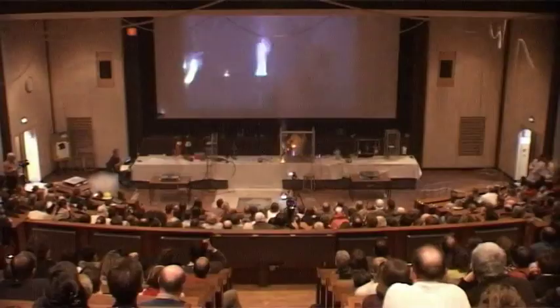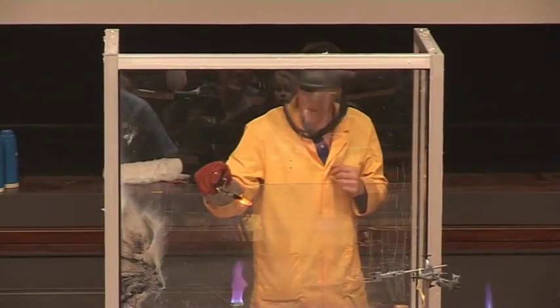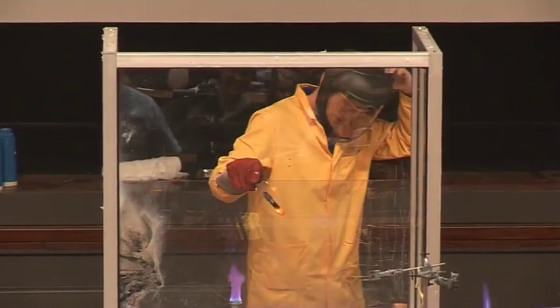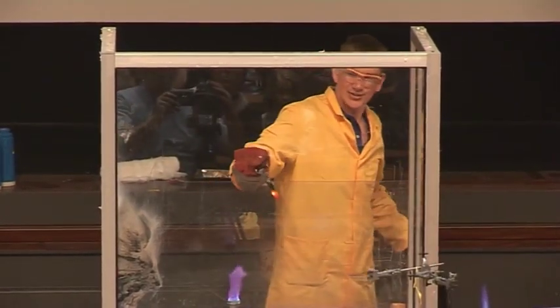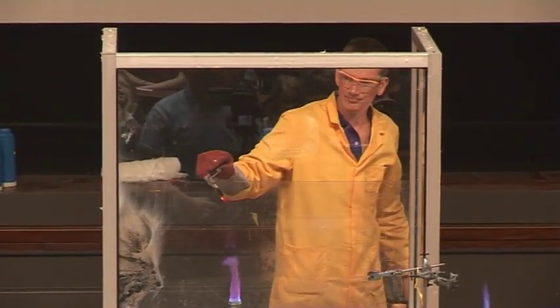Okay, there we are. It certainly did react. In fact, half of it's all over my safety screen. So even sand reacts with burning magnesium.